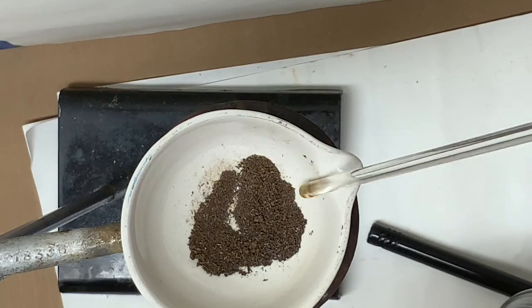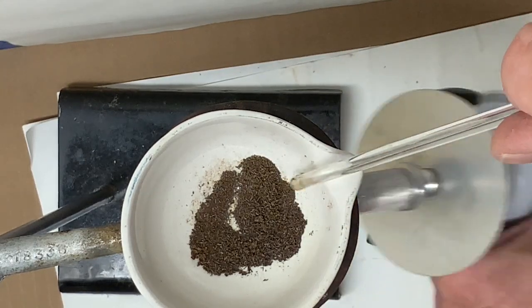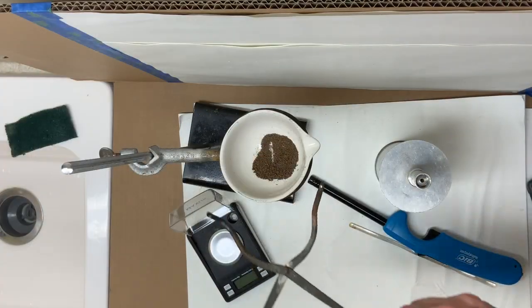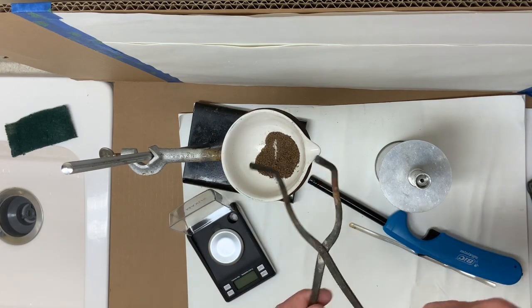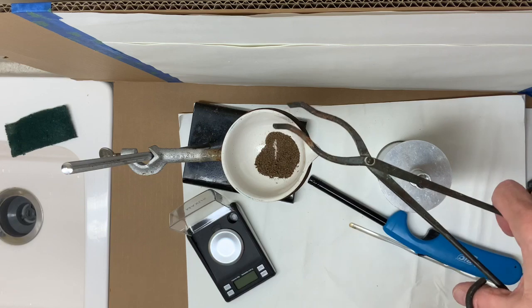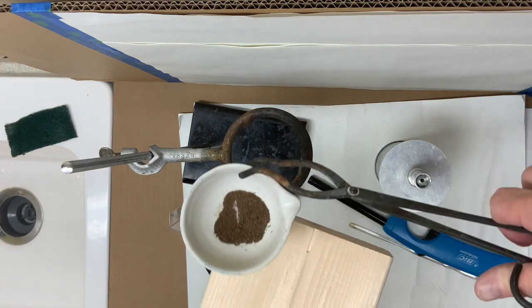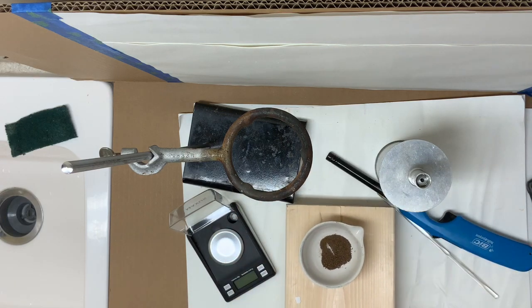In the next part, watch carefully how to use the tongs as opposed to how not to use the tongs. First, I'll start using them incorrectly, which could lead to dropping the dish, and then I'll show you how it would be best to turn the tongs over and actually grip the side. I'll place the dish onto a wooden board for cooling off.